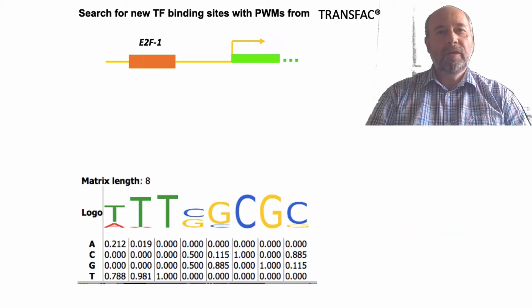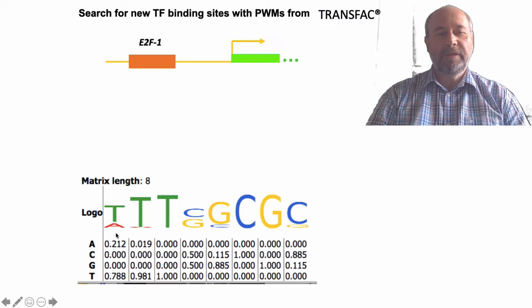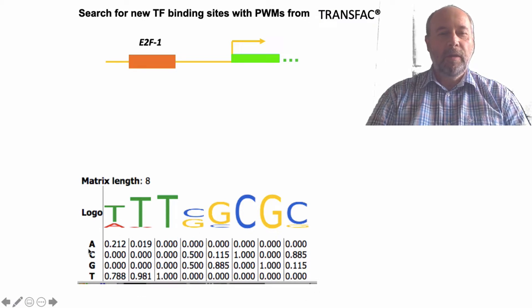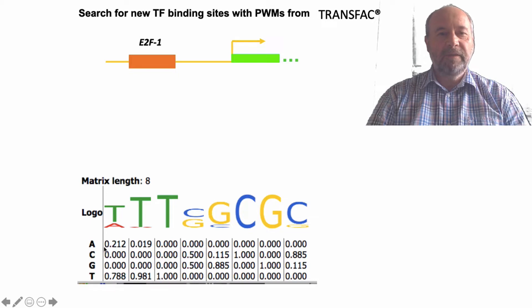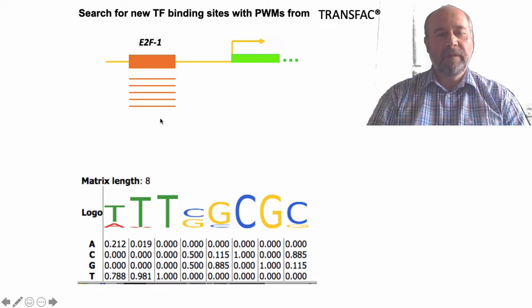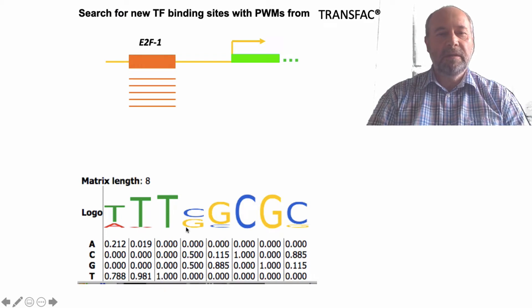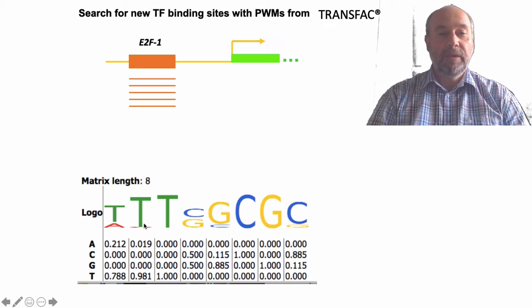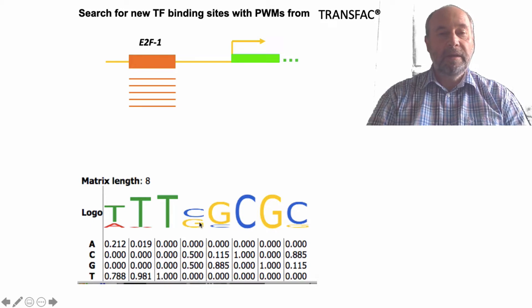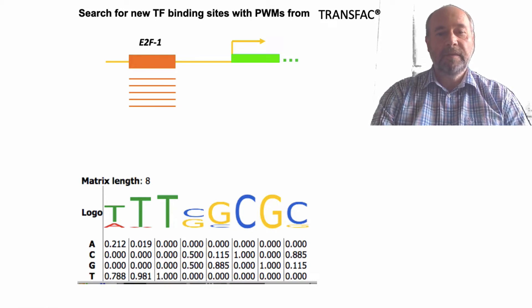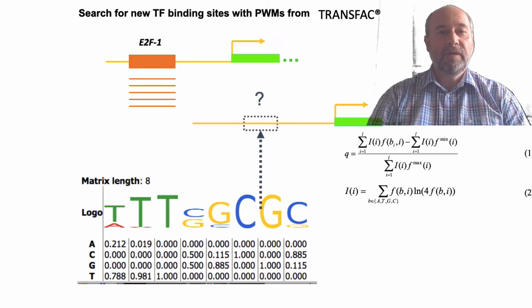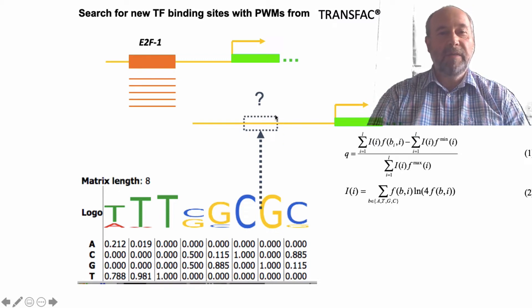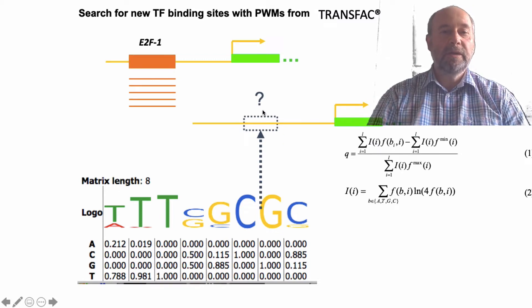As you know, in Transfac you have a lot of positional weight matrices, and one of them you can see here where we collect information from many binding sites from the literature to build such matrices. You can see the positional weight matrix can produce a logo, and then this matrix can be used to search for new potential transcription factor binding sites in regulatory regions of any gene.